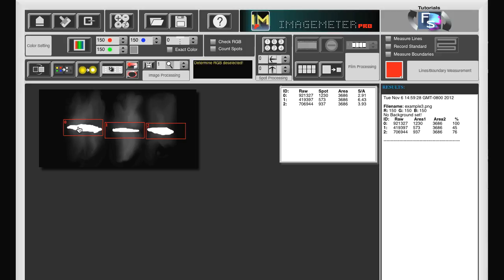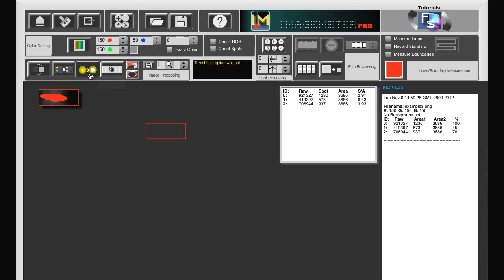We can now confirm that only the band, but not the background was used for measuring the density, by pressing the threshold image button. As you can see, only the band is red.